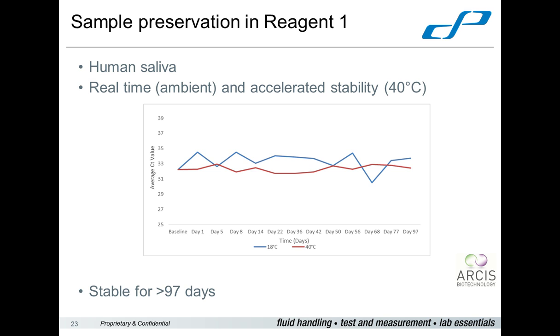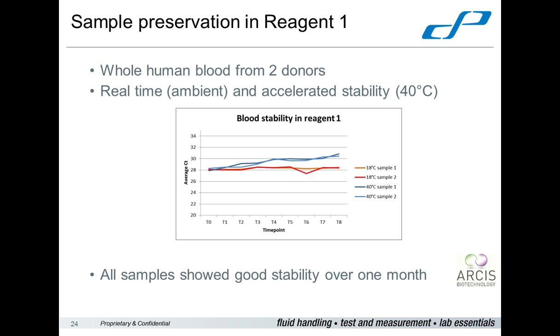100 days at 40 degrees C. Somebody more intelligent than me can do the Arrhenius equation and let me know what that equates to for real-time stability, but it's a long time. And it's probably long enough to suit most people's needs. So that was human saliva.